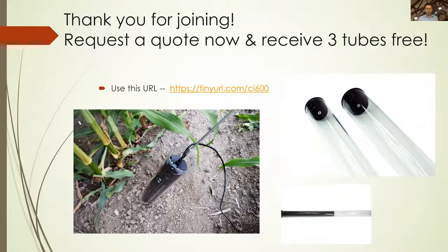Do you have microtubes to insert in pots 3 centimeters by 3.5 centimeters in height? No, we do not. The shortest tubes we have are 1 meter. There are other lengths of tubes, and I think you saw a few of them out there, but we definitely want to make sure that the full scan head, which is 34 centimeters by 6.35 centimeters, is able to do a full rotation.